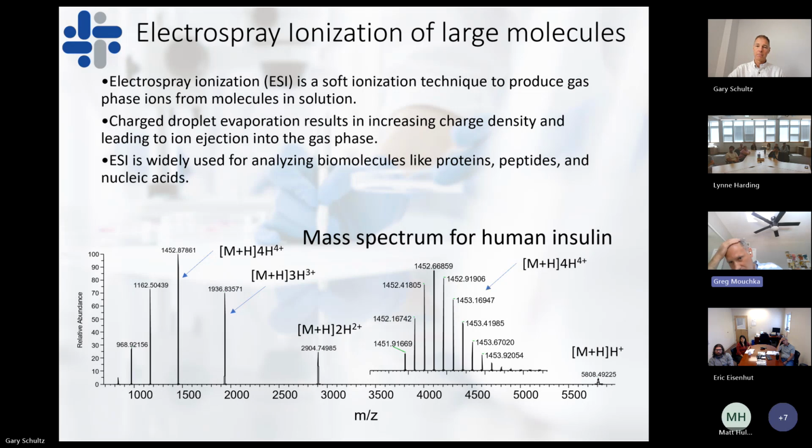I'm curious. You'd mentioned these orthogonal methods on the liquid chromatography, where you would put two columns in series. Can you explain a little more on that and how you come to the decision to use a method like that and execute on it?